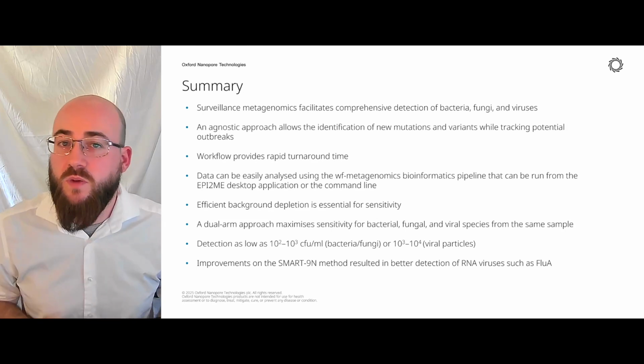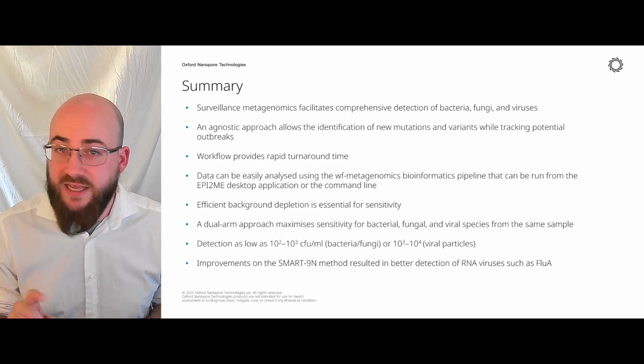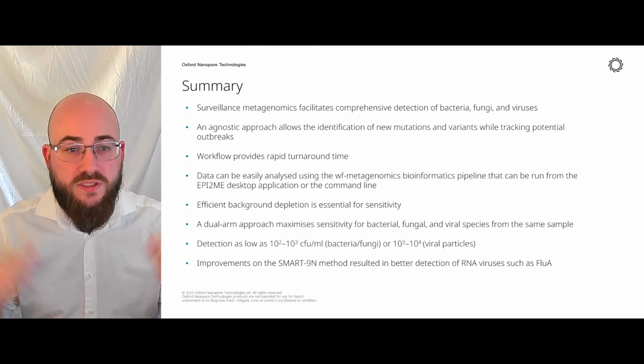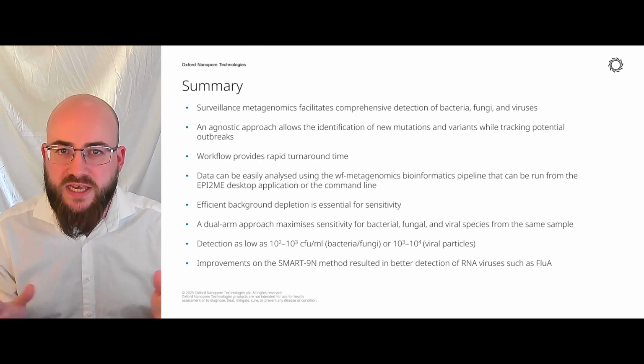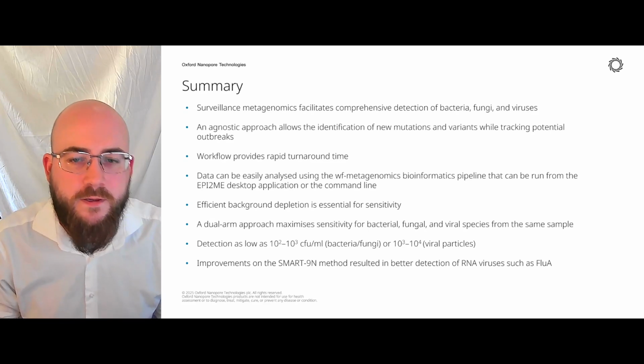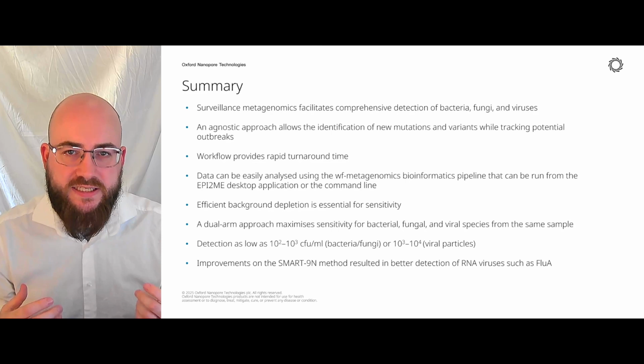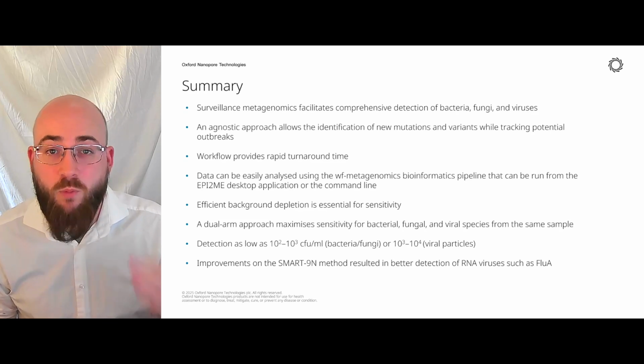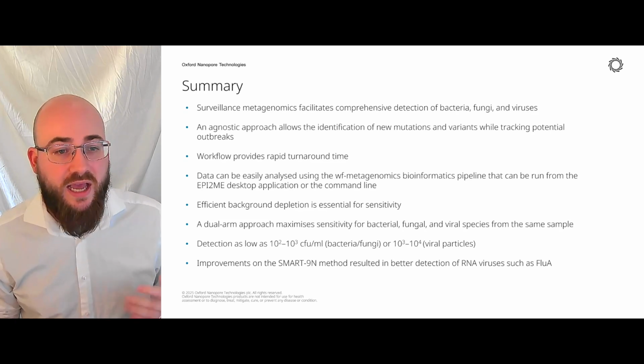And I will stress as well, we're not looking at taking two samples here. We start with one sample, centrifuge, and we've got both sides. We're not having to take two samples to begin with, so don't worry about that. But we need to treat them slightly differently because we're looking for very different things, and this is the approach to do that.